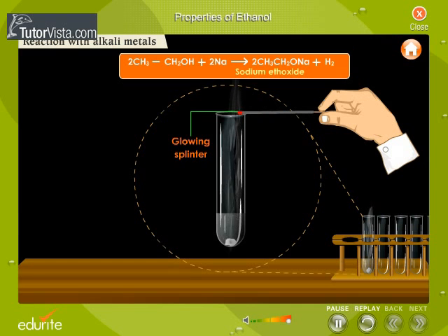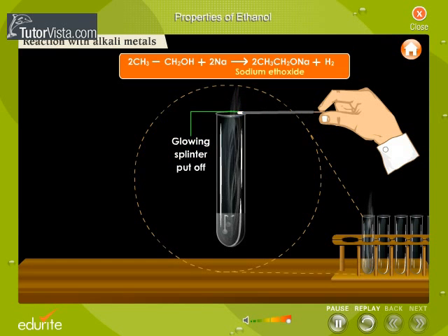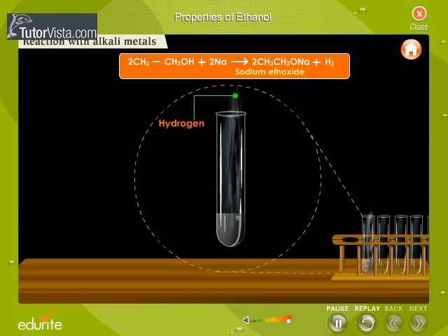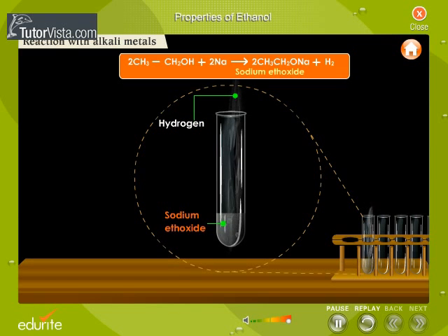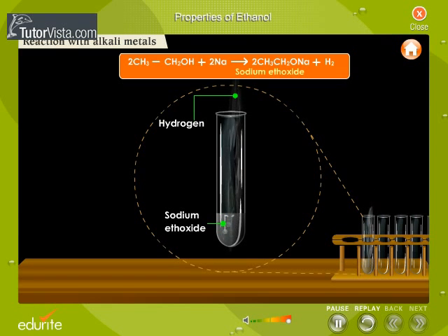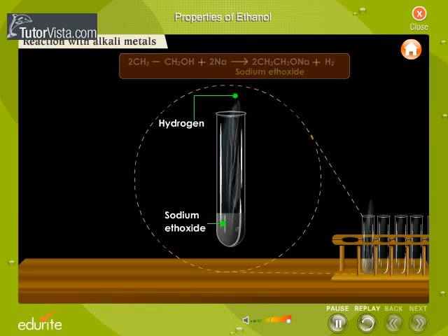The gas is tested with a glowing splinter. The splinter is put out and the gas burns with a blue flame, producing a pop sound. This proves that hydrogen is liberated. Ethanol reacts with sodium, forming sodium ethoxide and hydrogen gas. This reaction is often used as a test for ethanol. Effervescence due to liberation of hydrogen confirms the presence of ethanol.